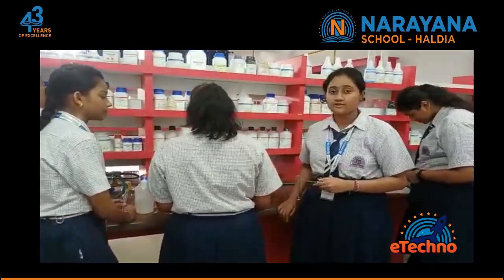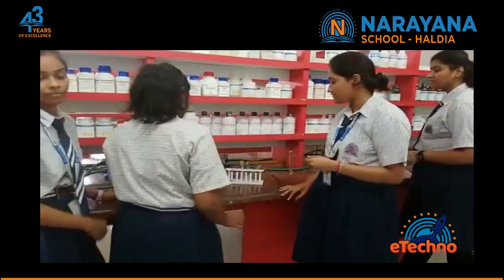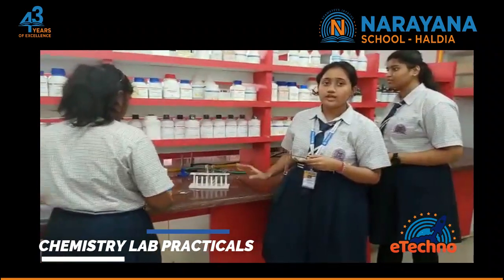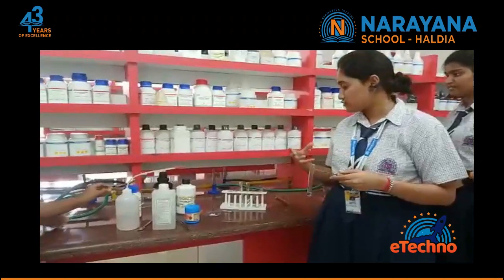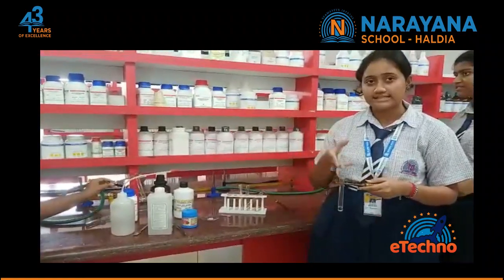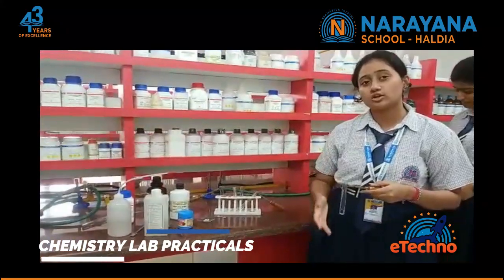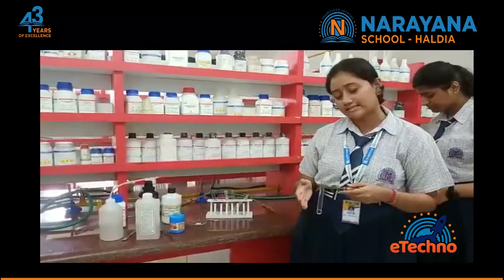For the next experiment we take two test tubes. In one test tube we make a sodium bicarbonate solution, and in another we take a small amount of organic compound. We then add the organic compound into the sodium bicarbonate solution, which results in the formation of bubbles, proving that carbon dioxide is produced.